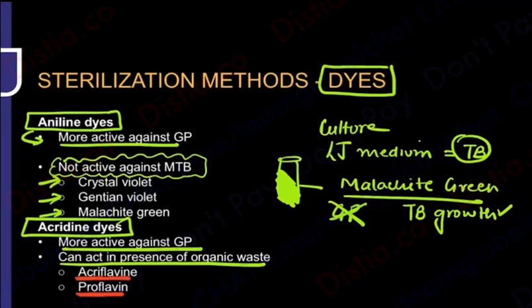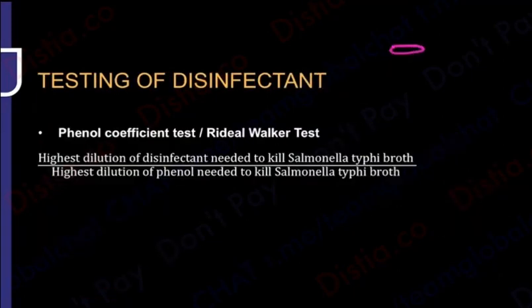So you've done a lot of chemicals, starting from alcohol, aldehydes, plasma, gas sterilization, oxidizing agents, heavy metals, dyes. Many of them you've done. But I want to ask you a basic question. If I give you 1-2 ml of a solution and I say this is a solution labeled X, can you tell me, is this a good disinfectant or not? Chemical X, you remember Chemical X in Powerpuff Girls, as a scientist tha, Chemical X ke saath he used to play and do different experiments. We are going to become that. So Chemical X we will take, and we will ask you, is this a good disinfectant?